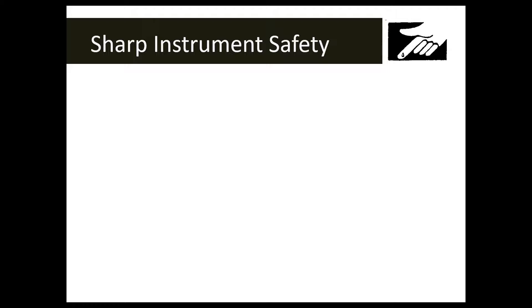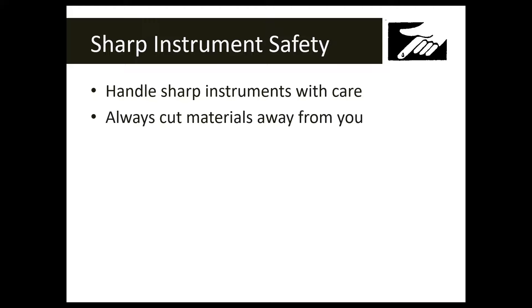The sharp instrument safety symbol is sometimes represented with a scalpel or razor blade. Either way, it means you're working with something sharp and need to handle sharp objects with care. If you have to cut something, always cut materials away from yourself and others. If your skin gets cut — including paper cuts — make sure you notify your teacher.